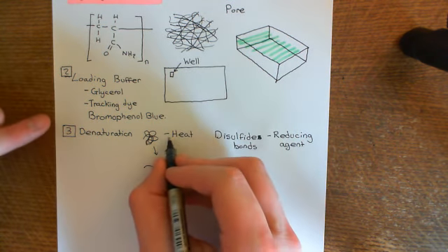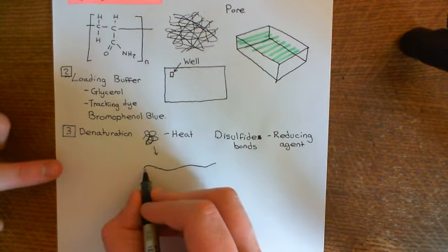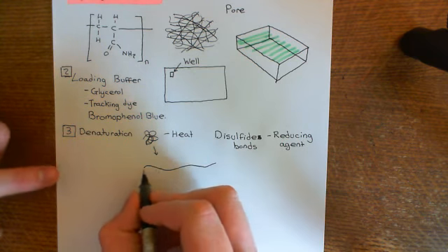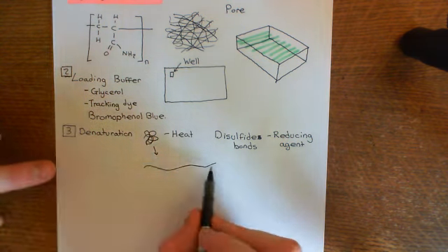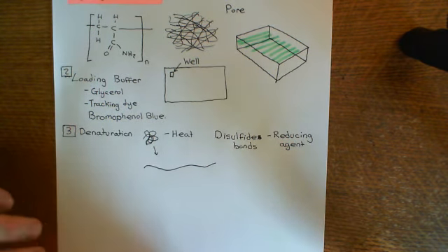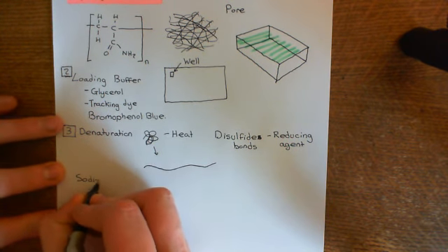And this is the important thing: you do not heat it high enough that you start breaking down the peptide bonds. You don't want the amino acids to start falling apart from one another. So it maintains its primary structure, but you destroy the secondary and tertiary structure. And now what you expose this denatured protein, this polypeptide, to is a molecule known as sodium dodecyl sulfate.